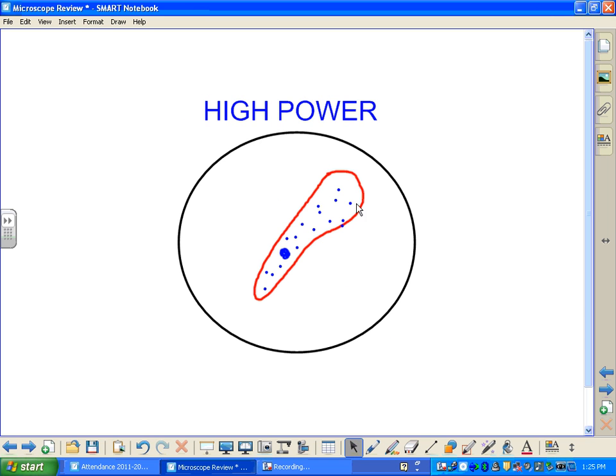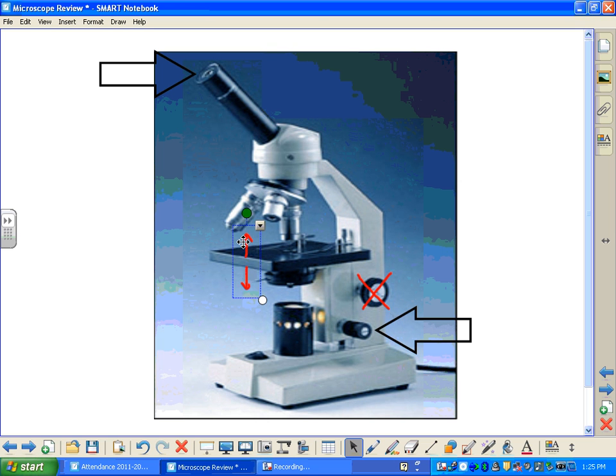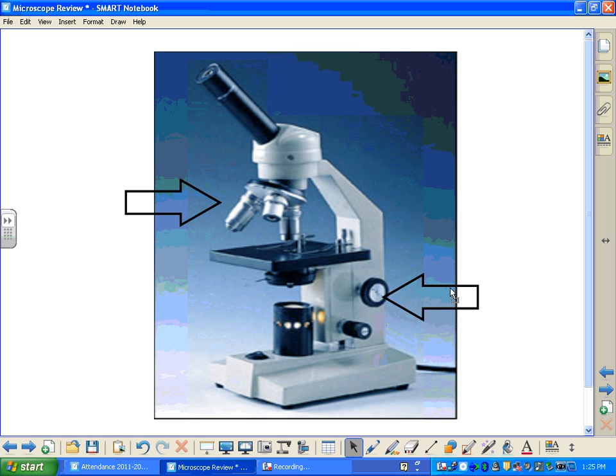Remember, when you're on high power, you don't necessarily need to center your specimen because you're not going to be switching afterward. When you're done observing under high power, it's time to shut down your microscope. You would take your low power objective and rotate that back down so it's pointing to your specimen, then use your coarse adjustment knob to lower your stage so that you have room to take your slide off. Once the slide is off, you can turn off your microscope using your on-off button, wind the cord around, and cover it up.